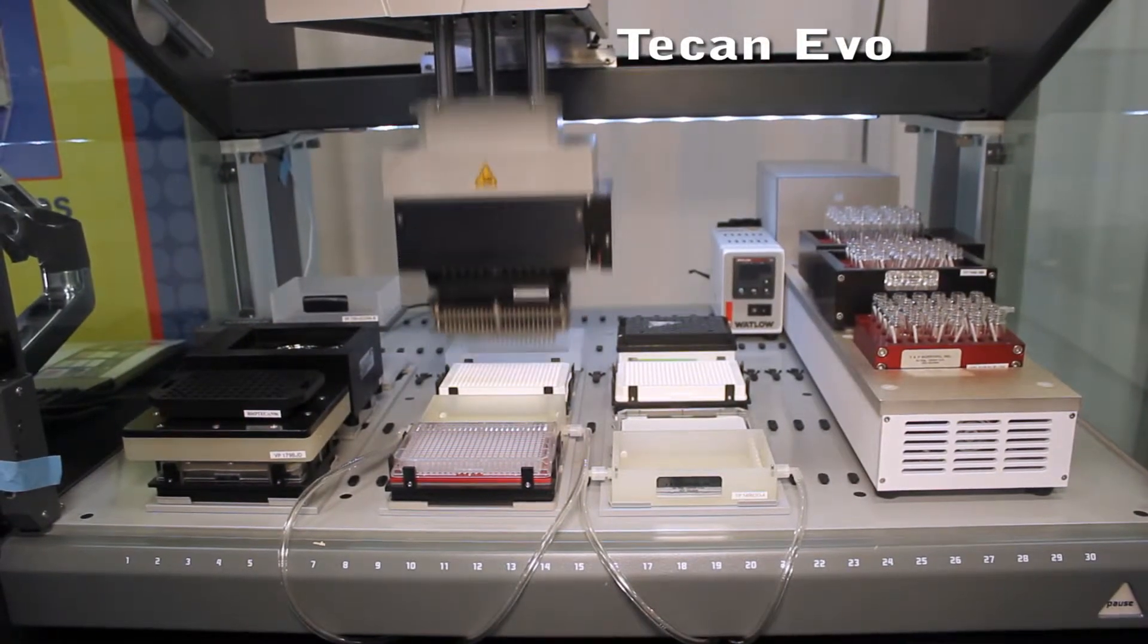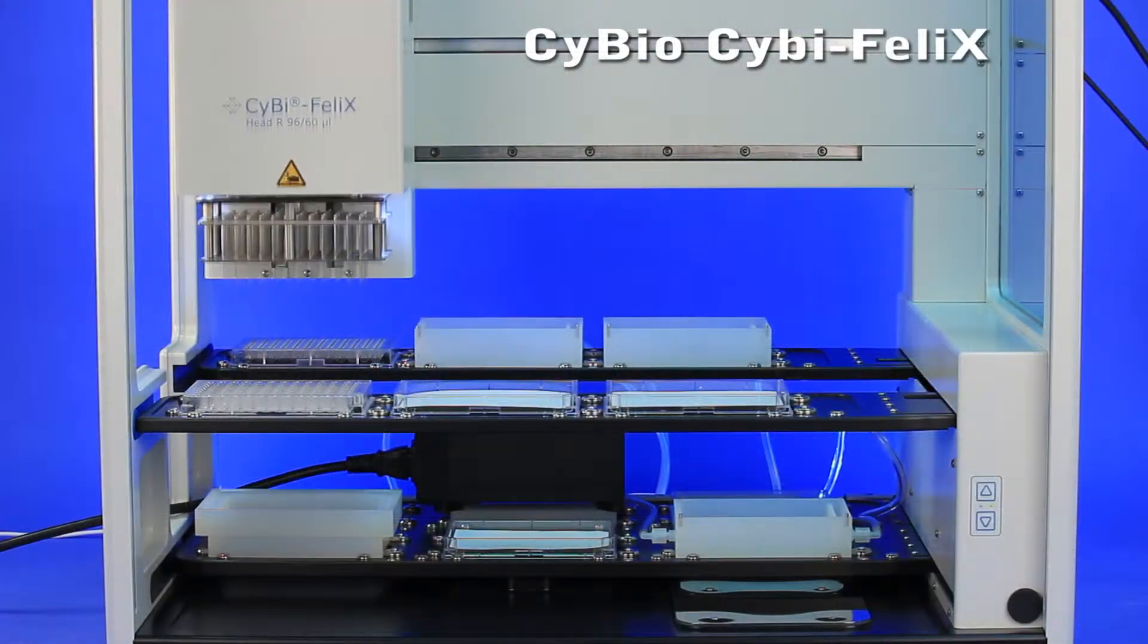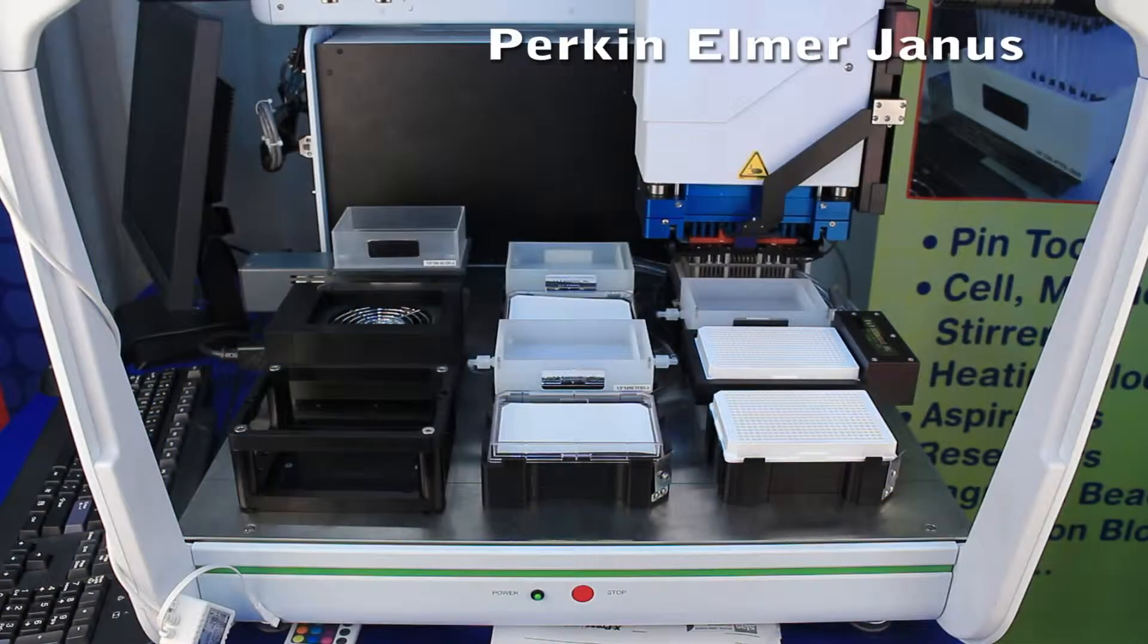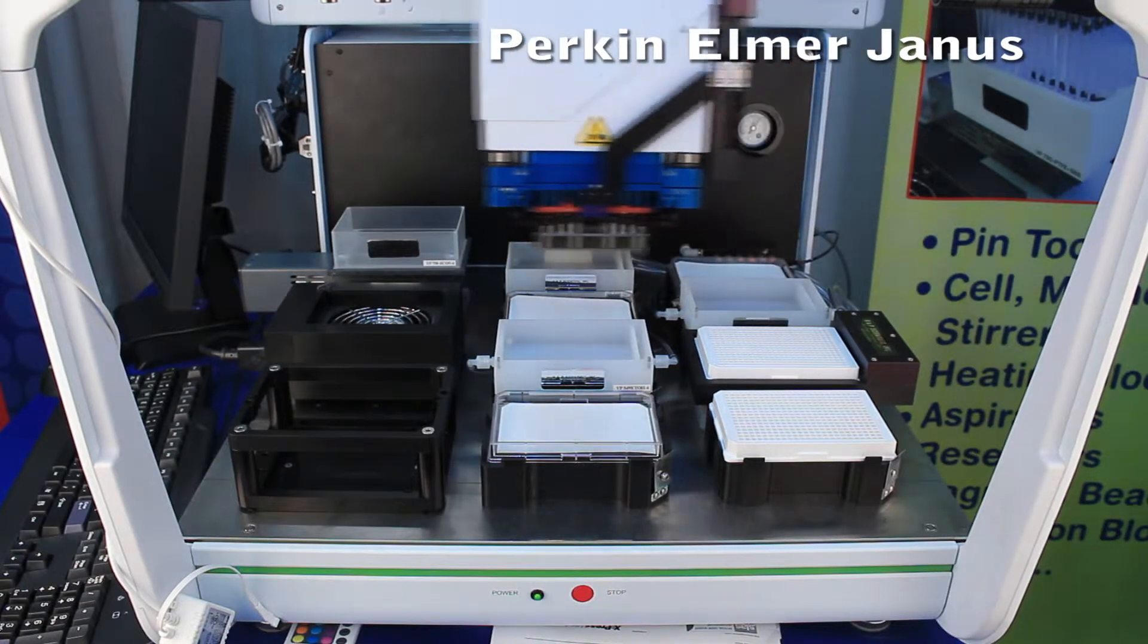Pin tools can be used for compound screening, high throughput screening, ultra high throughput screening, drug discovery, DNA dilutions, prep, and analysis.